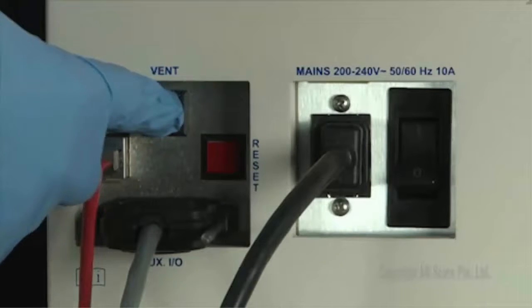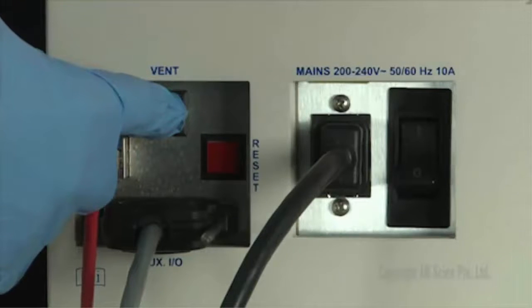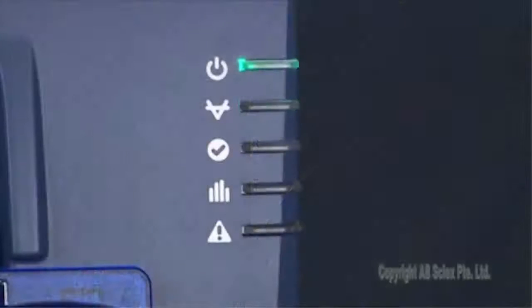Press and hold the vent button for three seconds. The instrument enters the vent mode and the turbo pump will spin down gradually. This is indicated by a steady power LED and a flashing vacuum LED.